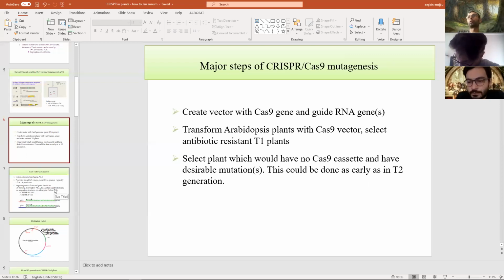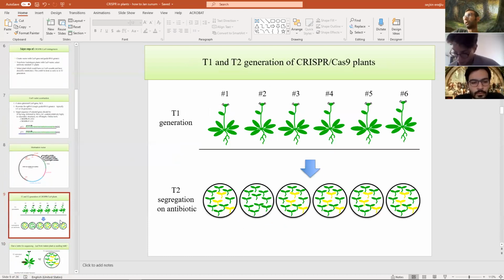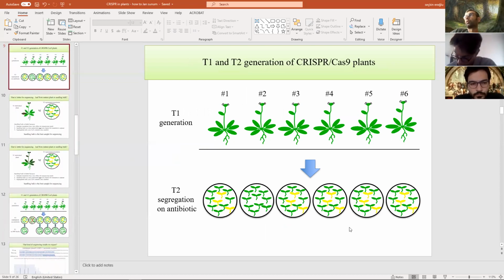But what are we doing in the intermediate steps? We need to have heterozygous plants. We don't want the homozygous ones. We don't want the ones that don't have the vector. Now I can refer to the presentation again, and I will also deliver it to you. We have the T1 generation and the T2 generation. So what do they mean?